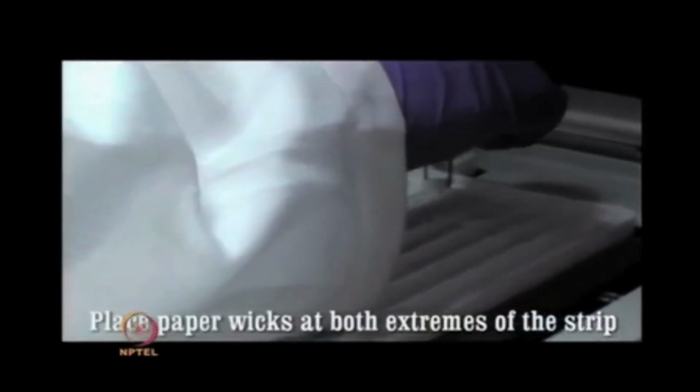Then place the two wicks at either end of the IPG strip, followed by an electrode at each end.